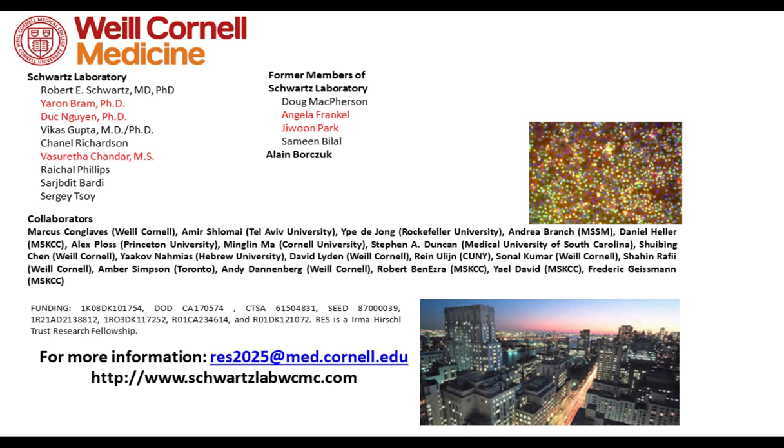So the first question is for Joe from NanoString. Why are nCounter and GeoMx technologies especially well suited to study infectious disease and COVID-19? And part of the question was asking, what makes the nCounter and GeoMx technologies more practical than, say, doing RNA sequencing?